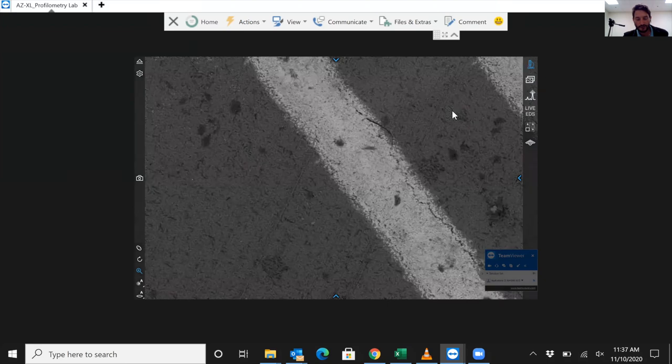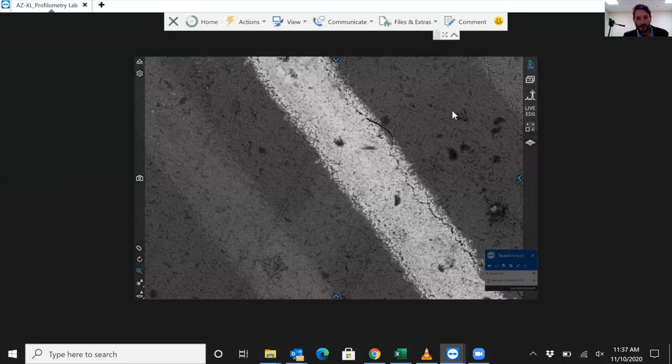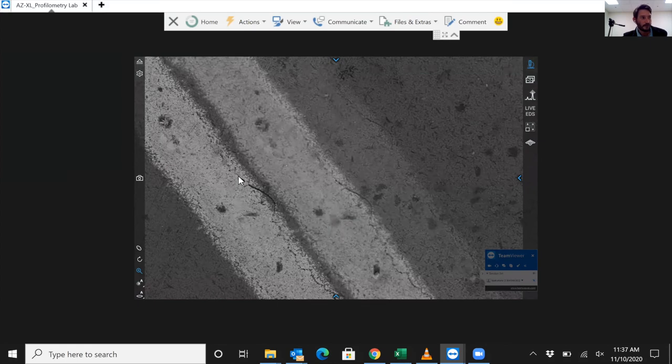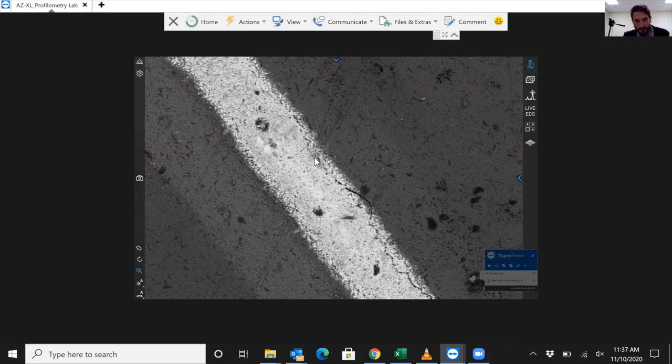And then I'm clicking on the screen, and whatever location I click is where it's going to center our field of view. You should be able to see me move it around here. And I'm zooming in. I click on this microscope button here, and that allows me to zoom in. So pretty straightforward.